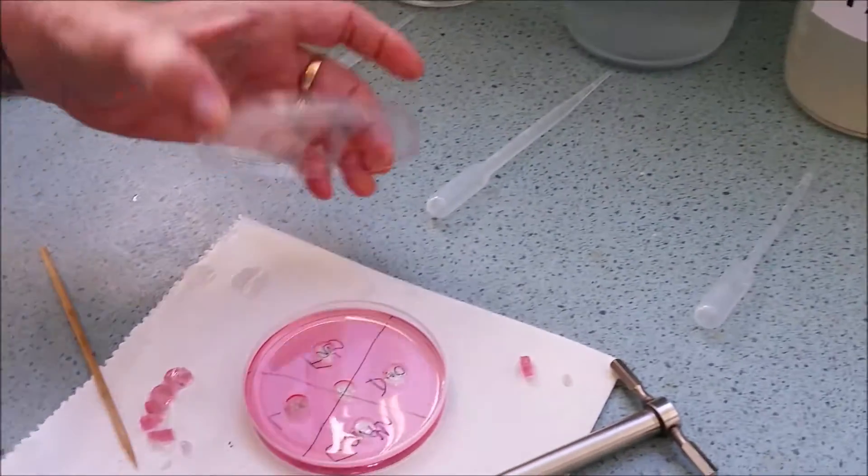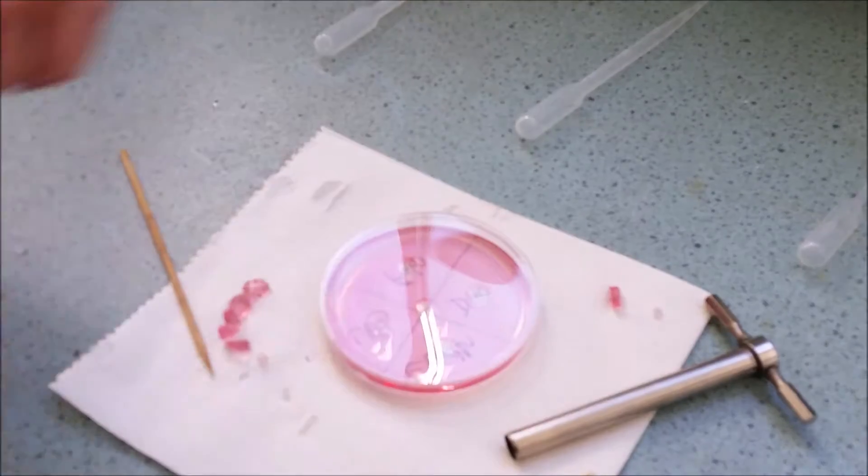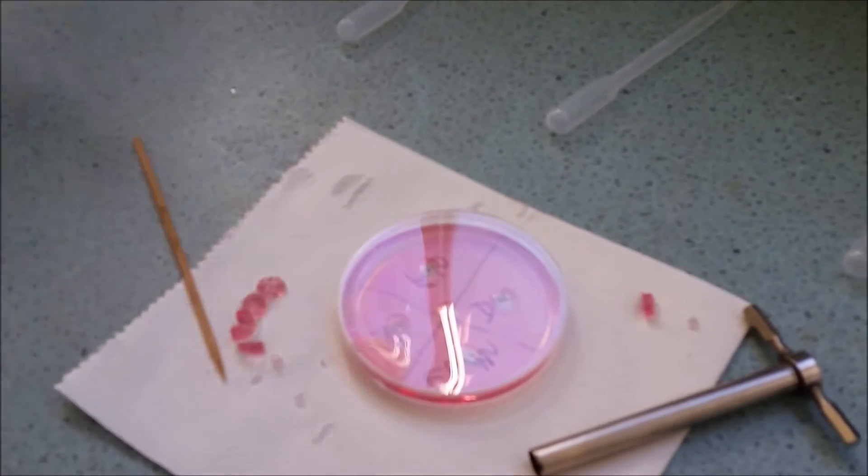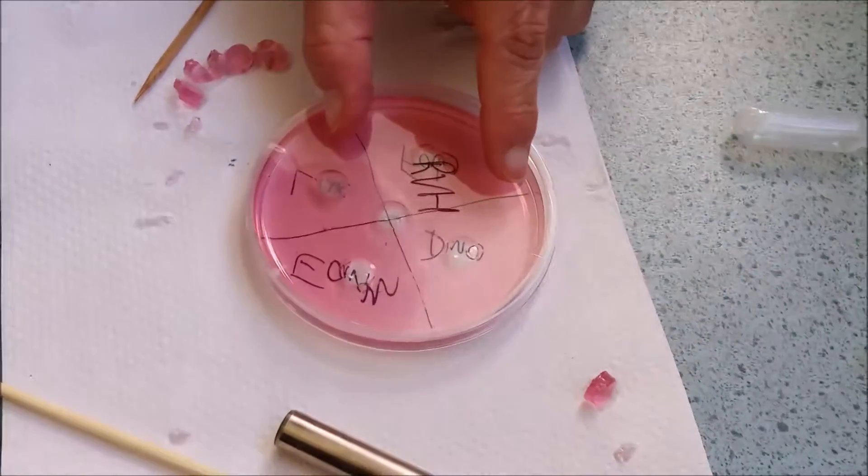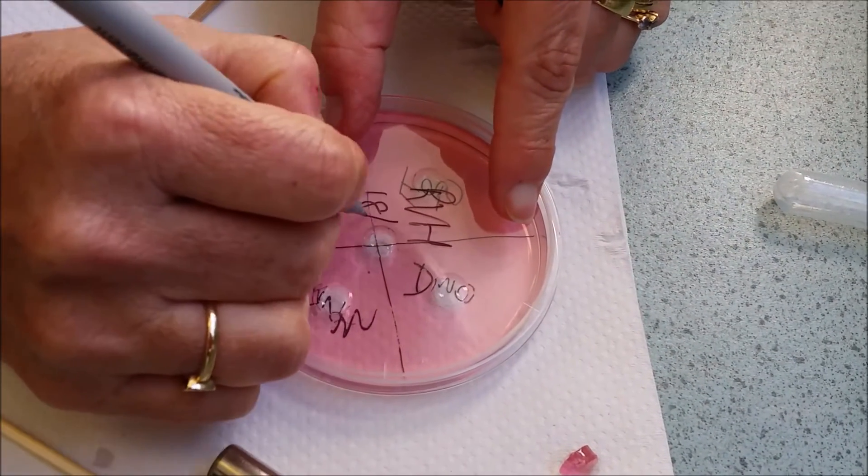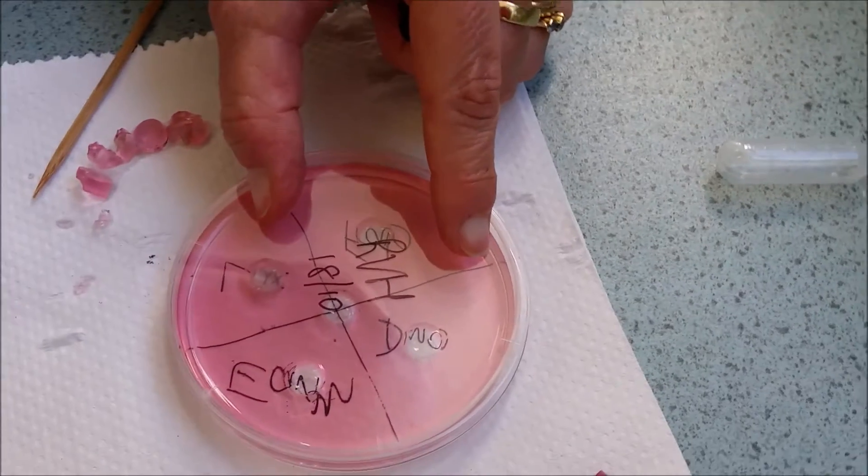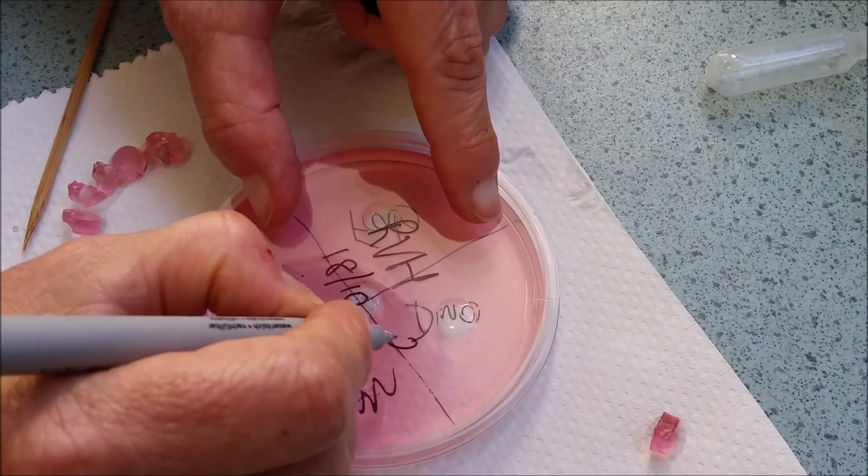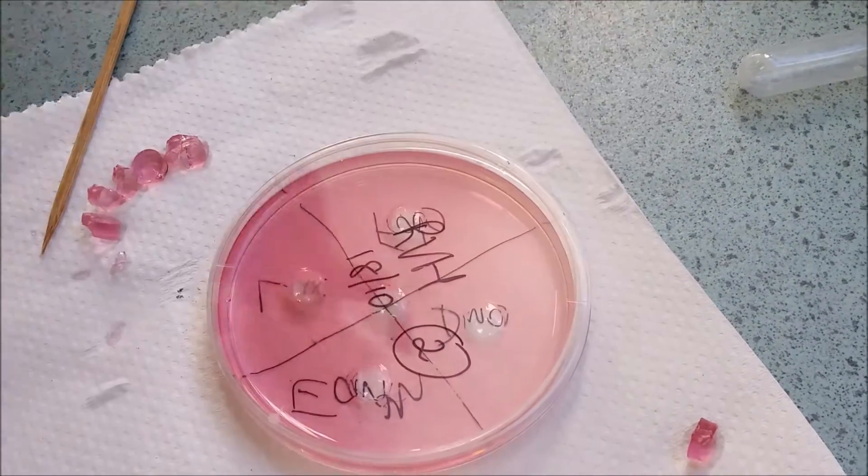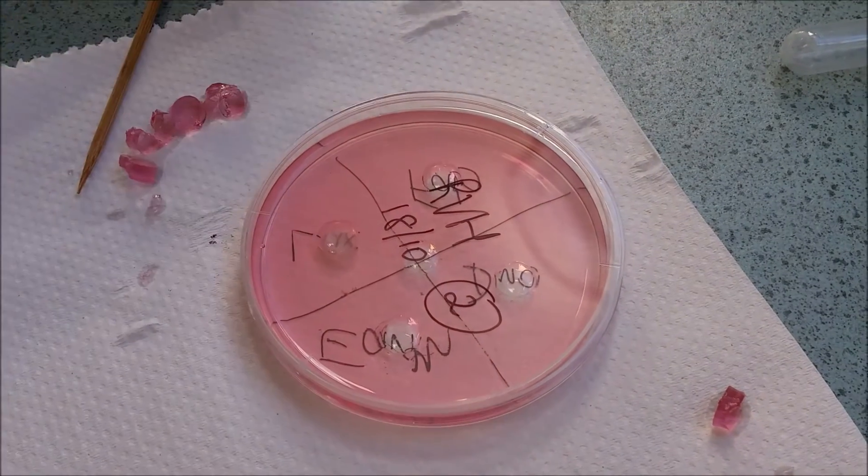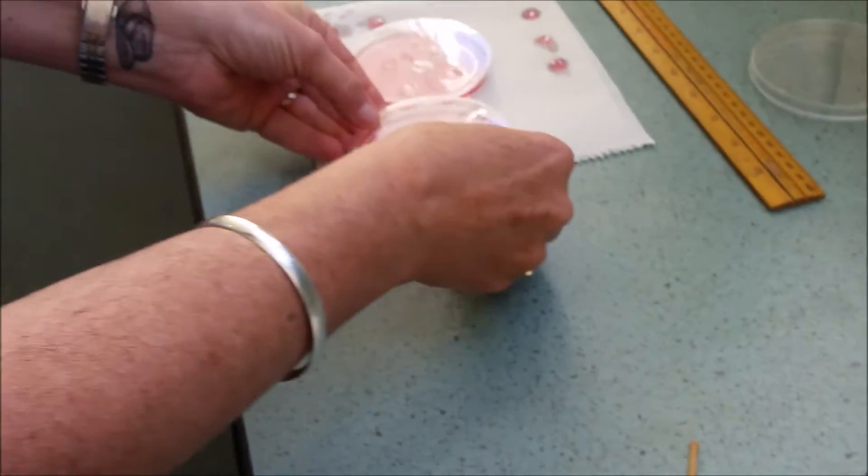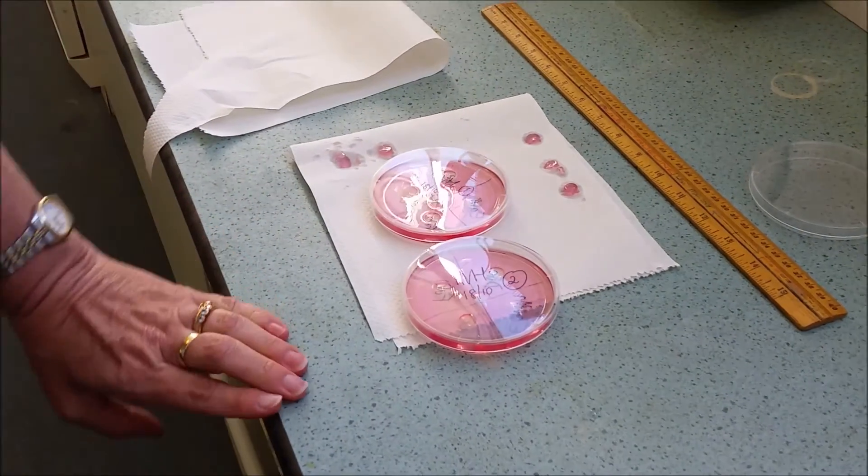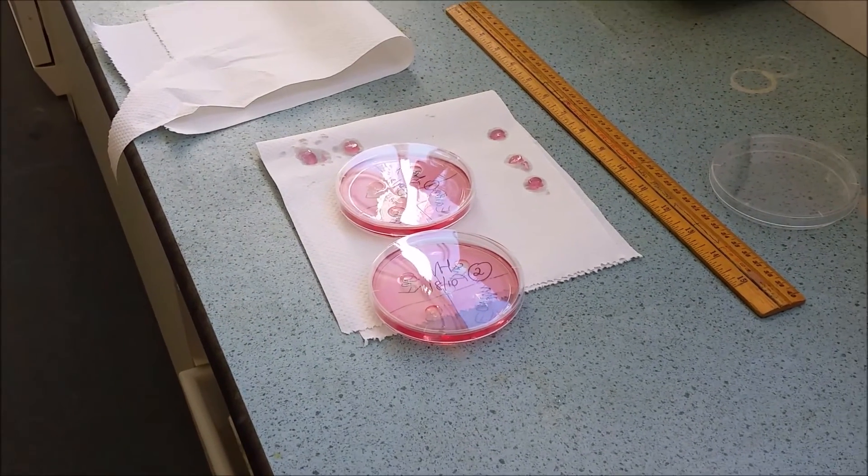Now I'm going to place the petri dish lid back on the top. I'm going to label it. Normally when you're doing lab work, it's a good idea to date it. And since I've prepared one earlier, this is my second. We'll do two. And we'll place them somewhere cool. And that's the procedure that you'll be following.